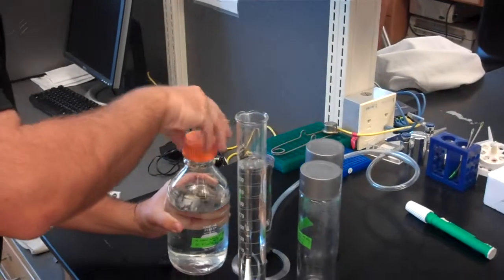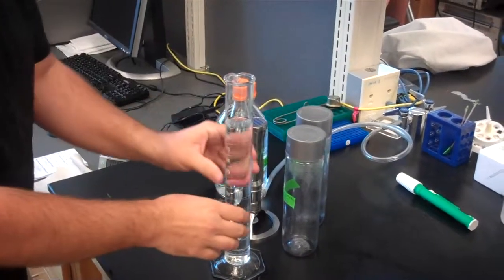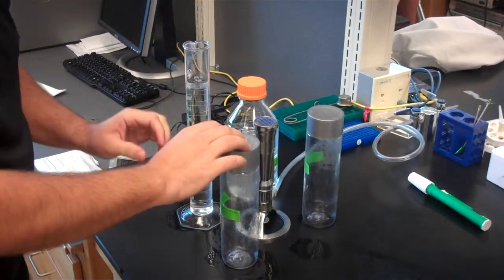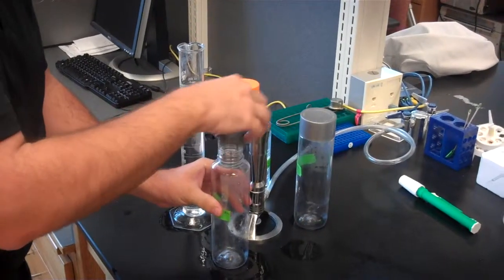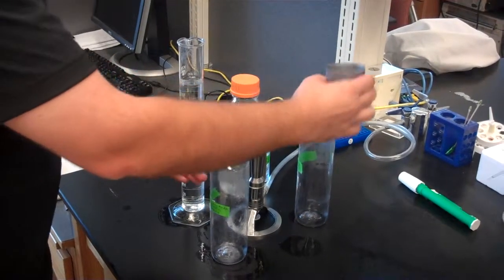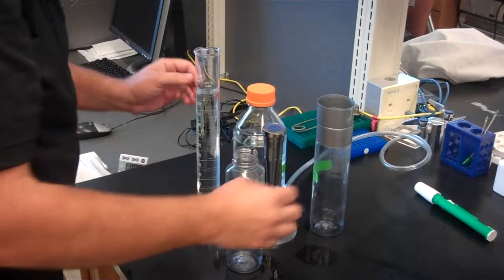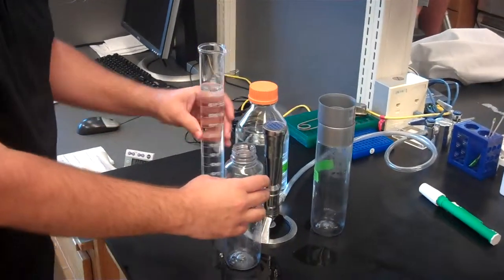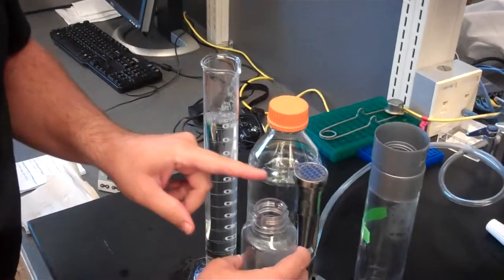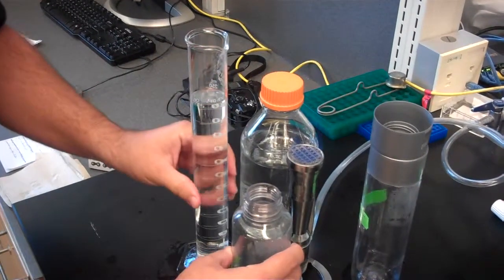Okay, go ahead and seal the bottle. And then I'm going to move this around to the back. I'm going to pull this over to the side and pull my first bottle in. Cap's been loosened, so I can take this off, and if I want to stabilize this, I could put this upside down on top. So I don't want to put it this way. I want to make sure nothing gets inside the cap. Okay? And when I pour, I'm going to be very careful not to touch the lip of the graduated cylinder onto the water bottle as well. Because again, anything that touches the inside of these is going to make that non-sterile.